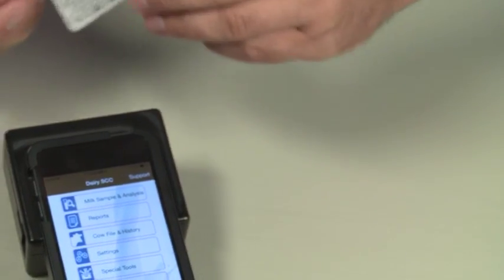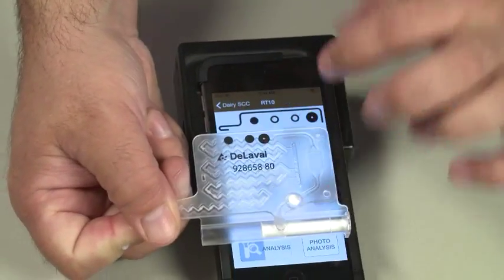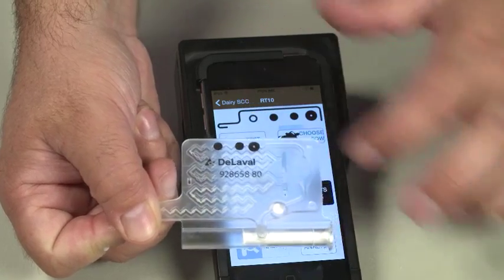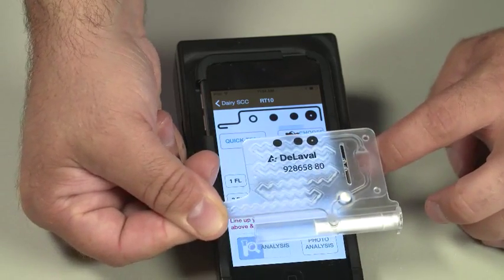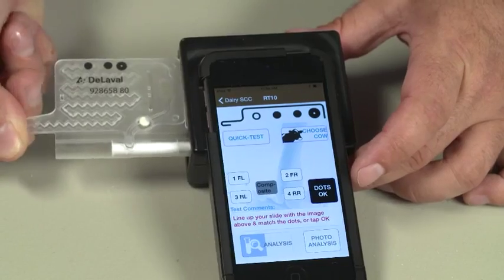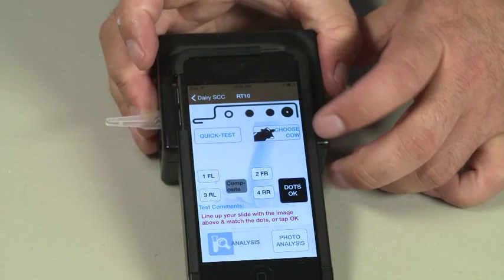To begin testing, tap the Milk Sample Analysis selection on the menu. Make sure the dot patterns on the slide match the dot patterns in the Dairy SCC app. The dot pattern function is a toggle — simply press to toggle on or off. To confirm the pattern, tap Dots OK. Insert the slide fully into the slot, holding onto the slide tip. While inserting the slide, you should see the dots on top of the slide.